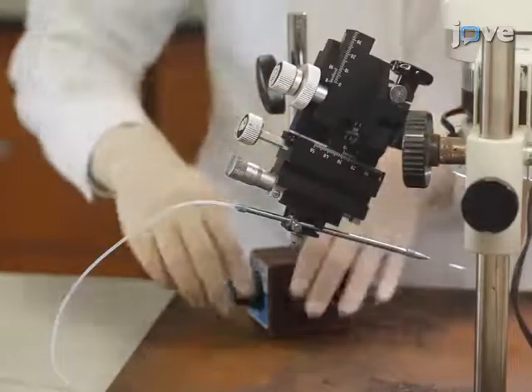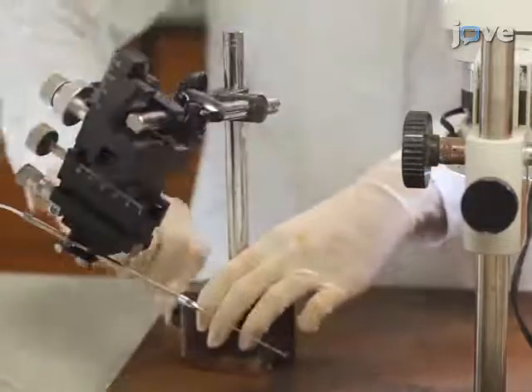Move the micromanipulator with the glass capillary to the side to prevent damage during the surgical procedure.